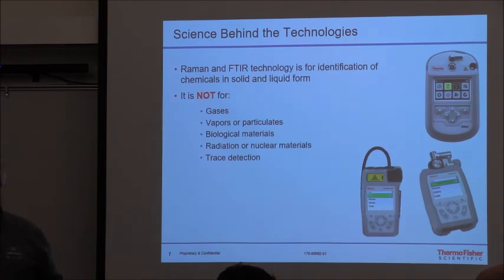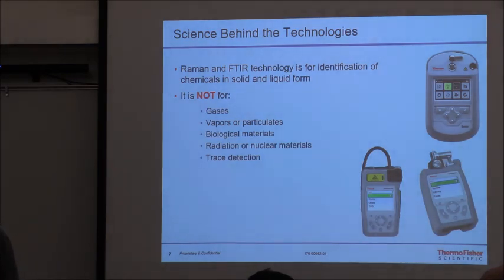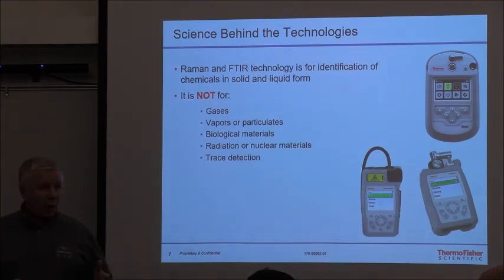When you run samples, do not be afraid to run a scan when you take something and run that same sample 2 or 3 times, because you're running the composite. Okay? It's kind of like taking a street drug or street narcotics. I'm assuming you're like every other city across the country and you have no opioid or no narcotic problems in the Salt Lake area. Okay? None whatsoever. But when you do sampling on street products, they're not always uniform, are they?